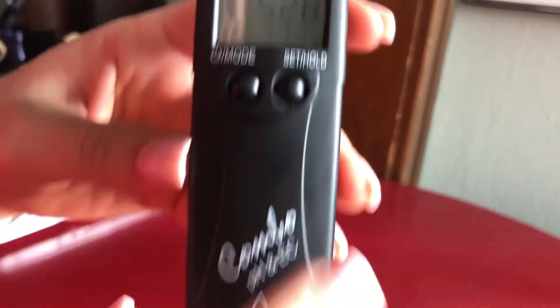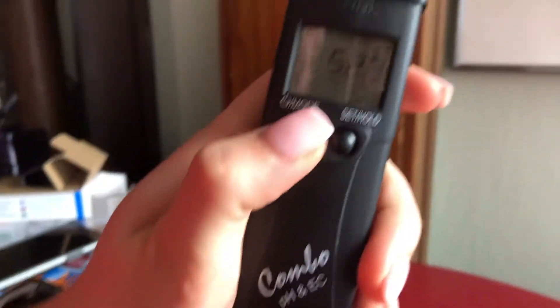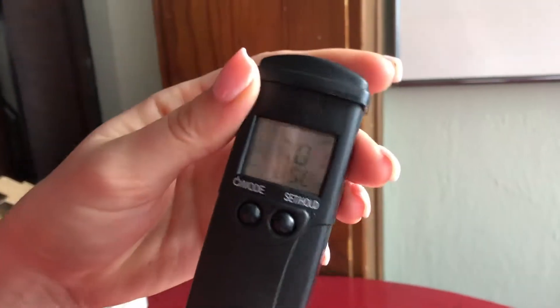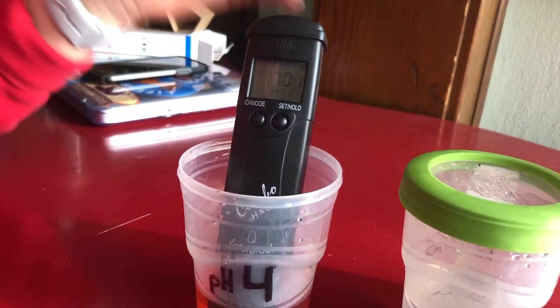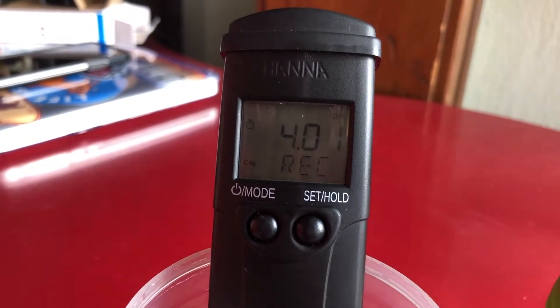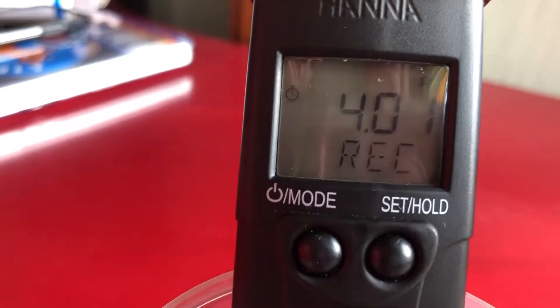To do the calibration for pH 4, hold the mode button until it switches from off to calibrate, then release. Go ahead and set the probe into the pH 4 solution — it's automatically going to recognize that you're using a pH of four.